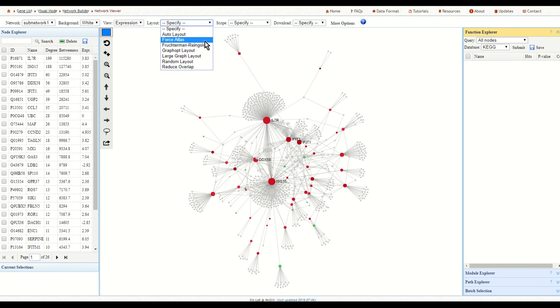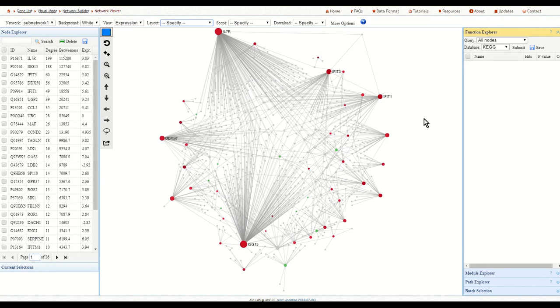You can try different possibilities here. One that I like quite a lot is Force Atlas, because there it rearranges the network in the way that basically the important nodes are all better visible. So you see that your seeds that you had in your differential gene expression list are listed here rather on the periphery of this network, and all the interacting proteins that had been identified by comparison with the protein interaction network are shown here in gray nodes.